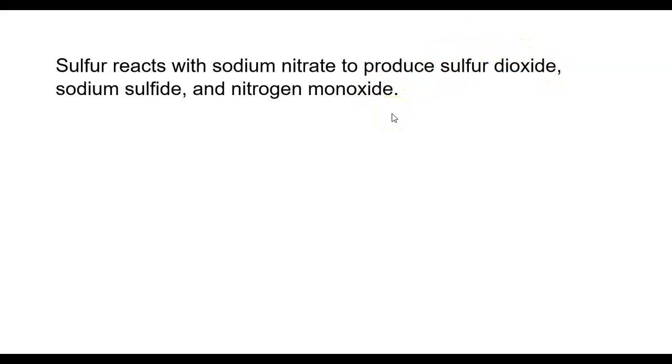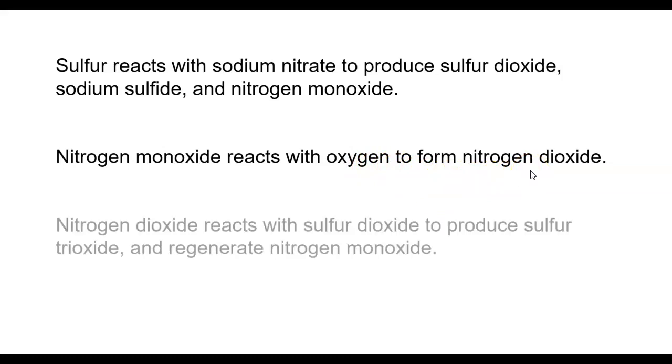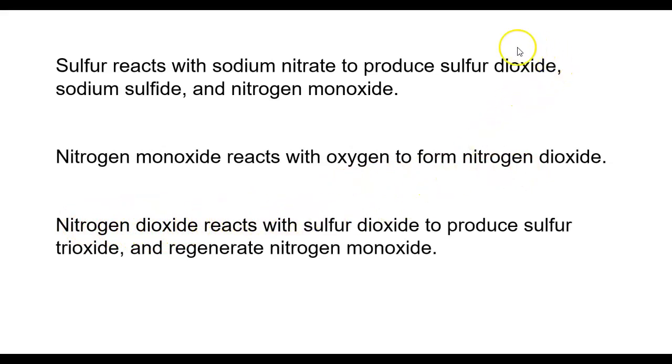The next thing that's going to happen is that nitrogen monoxide that we produce is going to react with oxygen inside the bottle, from the air inside the bottle, to form nitrogen dioxide. Then the nitrogen dioxide that we produce is going to react with the sulfur dioxide. Remember I said that the sulfur dioxide was what is eventually going to become the sulfuric acid. That nitrogen dioxide is going to react with the sulfur dioxide to produce sulfur trioxide. And meanwhile, the nitrogen dioxide is going to be turned back into nitrogen monoxide.